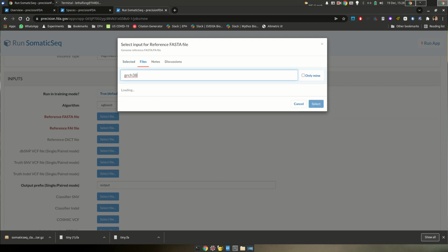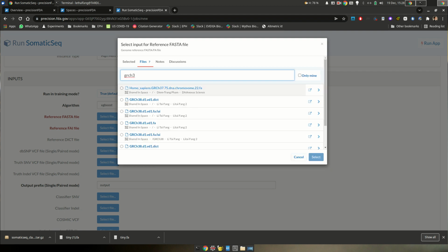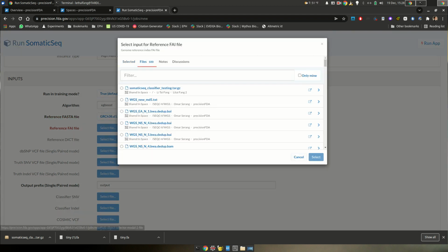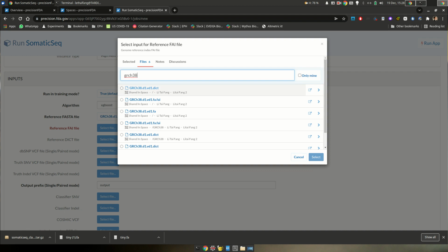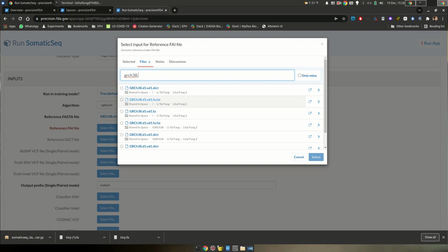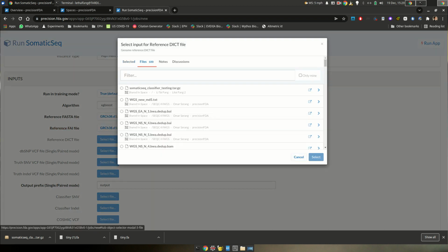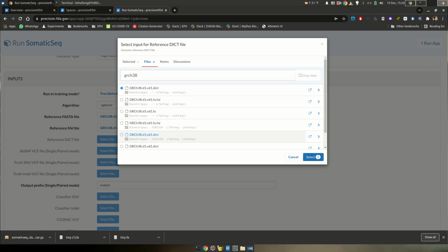GRCh38 shows up, then you kind of have to click quickly. Oh, this is very funny here. Boom. That file kind of shows up and is gone. I don't know what's going on. You have to be quick today. It's not always like that. Uh-oh, you're playing with me here.